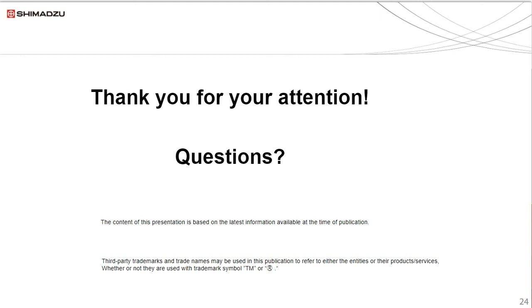The limitation there is detection limits. The sensitivity isn't quite as good as ICP-MS. So you can use it as a screening tool, and in most cases to test oral impurities, where the guidelines are much higher concentrations than inhalation, for example, or as a screening tool, or you send it out to a third-party lab. And because XRF is much faster and there's no waste, no sample prep, et cetera, you can get pretty good results very quickly. But the gold standard remains ICP-MS just because of the sensitivity.